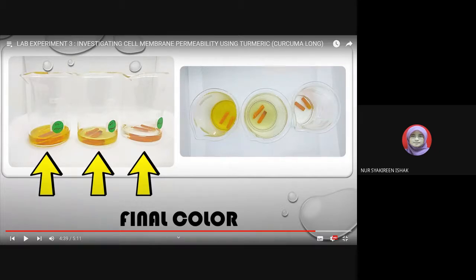You are using water, diluted ethanol, concentrated ethanol, it does not apply to the concept of osmotic solution, sebab kita bukan menggunakan gula ataupun garam ataupun other salt as solute. Tapi kita melibatkan konsep apa kat sini?